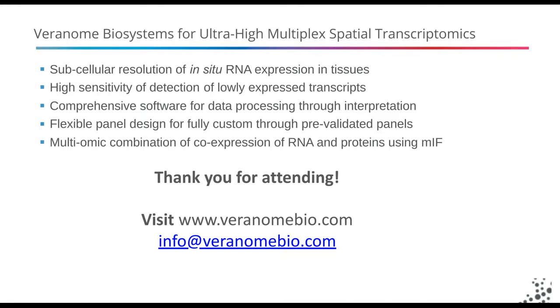So let's get started. Our first question is, your data with glutamate and GABA markers for discriminating neuronal types showed impressive sensitivity and specificity in the cortex and hypothalamus. Do you have data on other markers that perform as well?